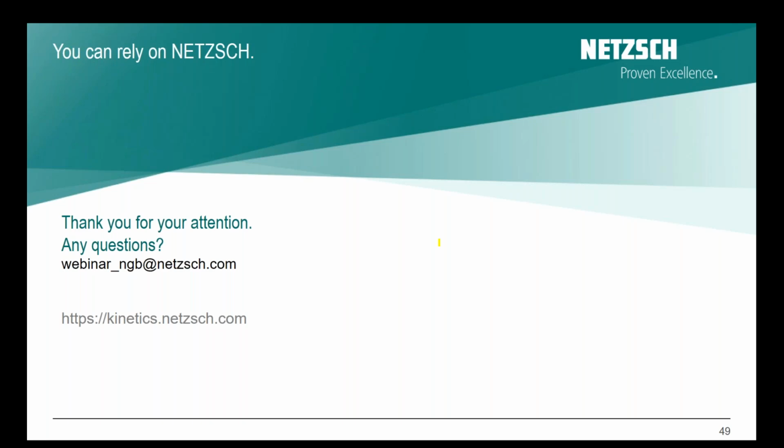Okay. And I would have 2 other questions, if it's fine with you. Yes. Could you introduce more about the Avrami equation application in the Neo from the point of nucleation? So right now we have, what do you mean? What does it mean more? Right now we have Avrami of the second order. It means the 2-dimensional Avrami, 3-dimensional Avrami, and nth dimensional Avrami, where n is an unknown value of dimension. And here the software can find the value of n just to make a better fit. And what does it mean more? I really do not understand. Yeah, so, probably I will write. Yes. Okay, so we will write to them.